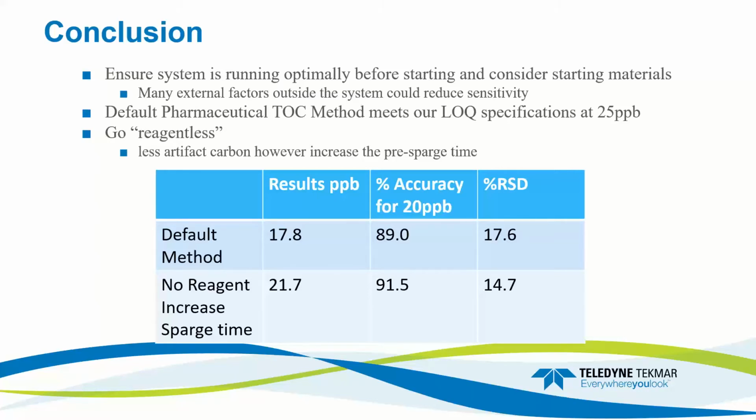So with this, in conclusion, a clean system, clean reagents, clean water, the proper schedules, the proper methods will ensure us to have the best limits of quantitation that we can achieve with the Fusion system.